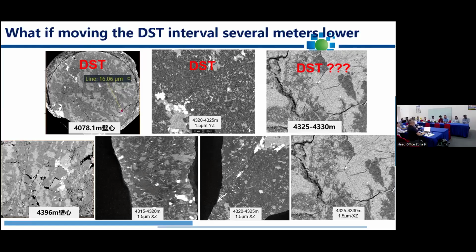Let me show. I remember your question, the comparison of the cuttings and sidewall core. I do have it on my computer, but I cannot show it. What I can do after the meeting is send you two examples. One is the comparison between sidewall and the cuttings. Another one is to answer the chairman's question. Just look at the CT image. Do you feel comfortable that the results from the cuttings are good enough? What is kind of a 1 to 2 millimeter area image?